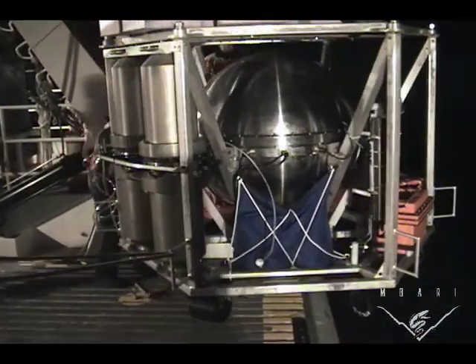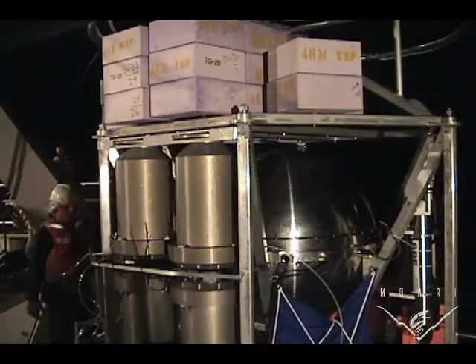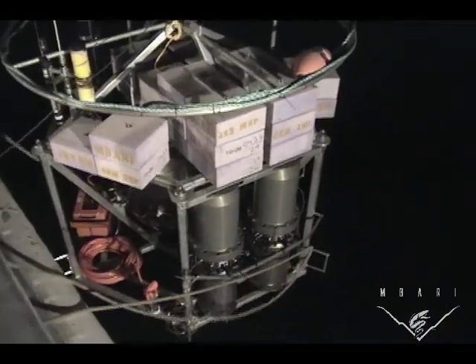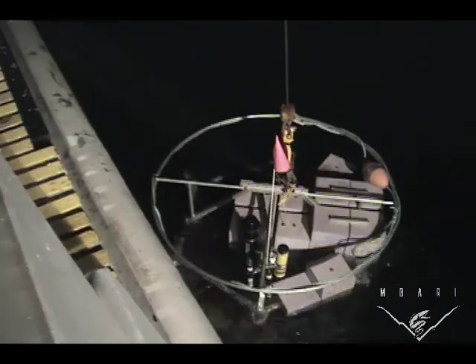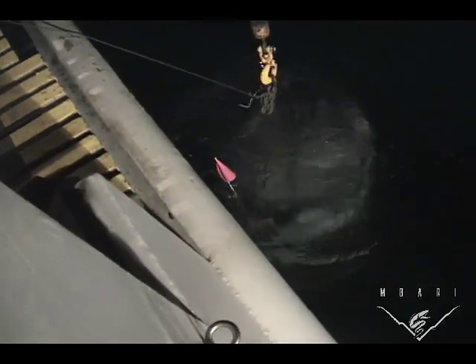Here we are launching the deep ESP — it's in this thing we call an elevator, and you'll see why in a moment. After we load the ESP over the side and pull the cord, the ESP will take about 50 minutes to sink to the bottom, which is, at this site, 1800 meters deep.